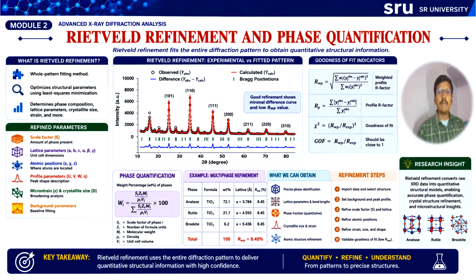A good refinement procedure produces a very small difference profile at a low reliability factor. The reliability factor indicates the quality of refinement.